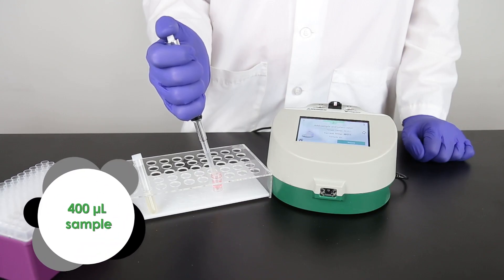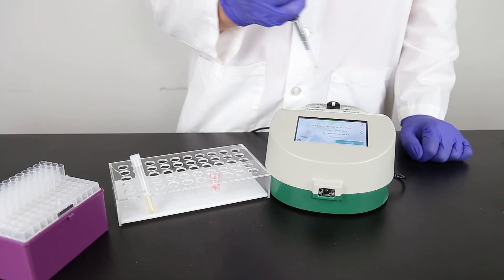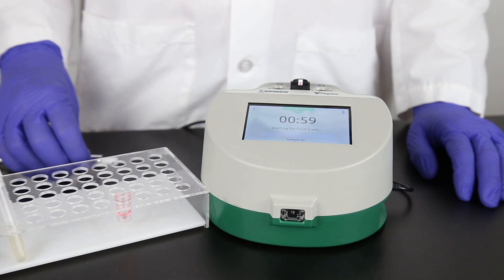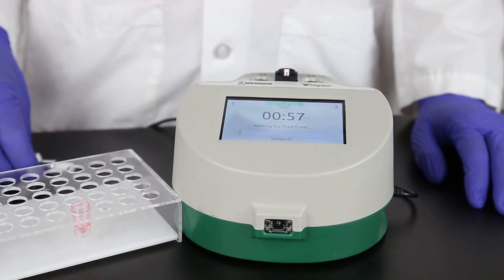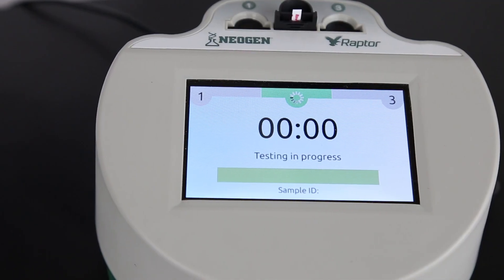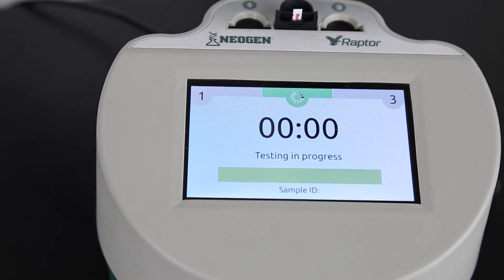Pipette 400 microliters of sample into the Raptor cartridge. The system and timer will start as soon as it detects the fluid front on the sample strip. You can now start samples in the other two ports on the Raptor. Each port operates independently. After the six-minute testing time, the Raptor displays your results.